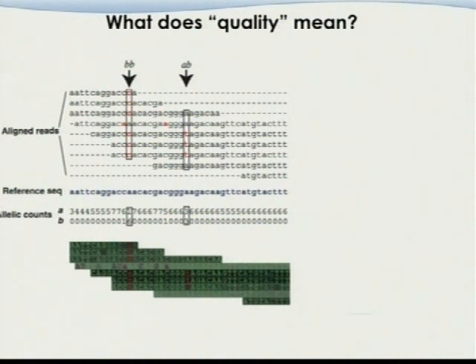When we talk about the quality, in the future I want you to keep in mind that it's not one thing. Quality is not a word by itself, so it doesn't mean anything. There are three different types of quality. So every time we talk about quality, we want to identify which quality we are talking about.